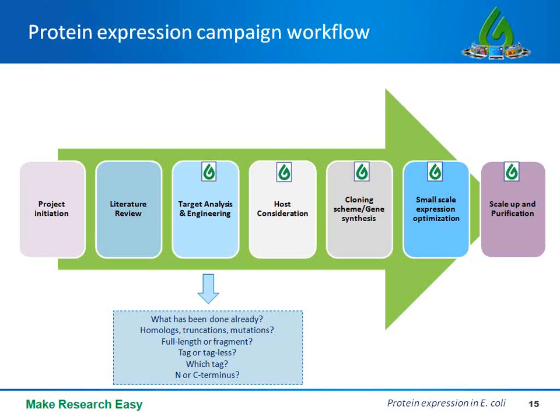There are recombinant protein solubility prediction programs which can tell you the probability that your overexpressed target will be soluble in E. coli. Other considerations are, will you make tagged protein or will it be tagless? Will you place the tag at the N terminus or C terminus? What's going to be the cleavage tag? We already reviewed the host consideration parameters earlier.